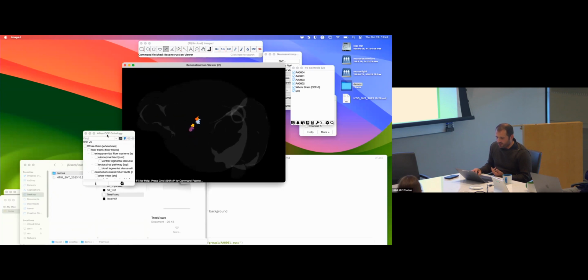And so you can load meshes, you can load reference brains. That's what I want to show you. So you have the different fly brains, and there is an Easter egg here. Yeah, you've seen it. Oh, why is it not appearing though? Oh, man. Oh, yeah.